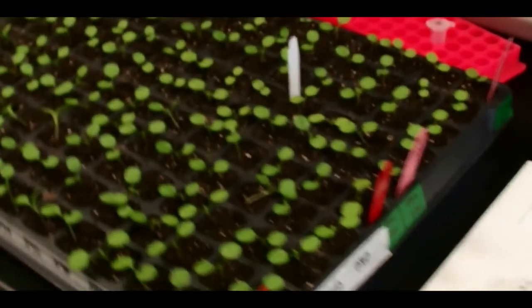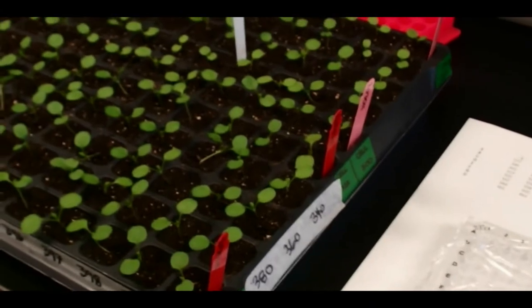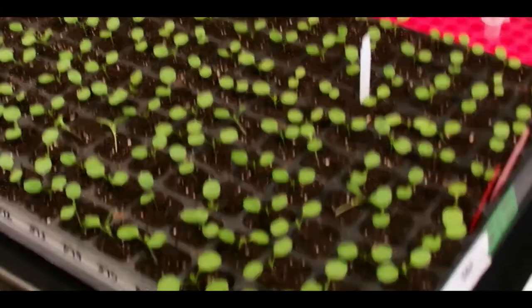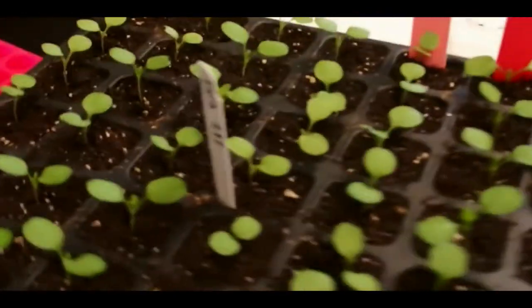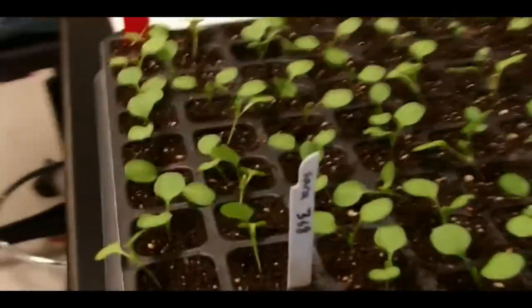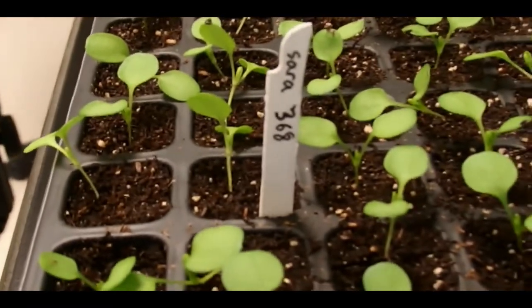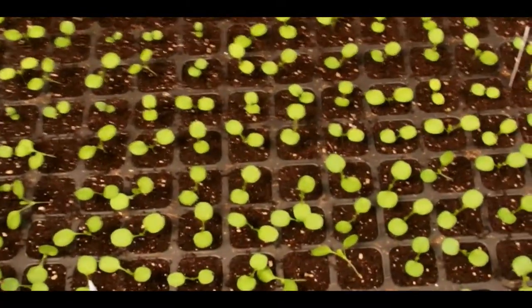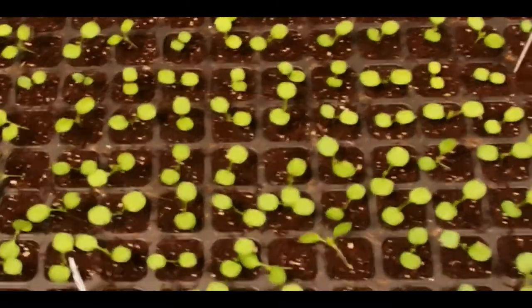Here, Sarah is going to work on a group of 92 plants. All of the groups are going to be 92 plants. And she's going to work from 277 all the way through 368. And on these flats, these things are numbered like a book, where that plant is 200 and then this plant is 400 here.